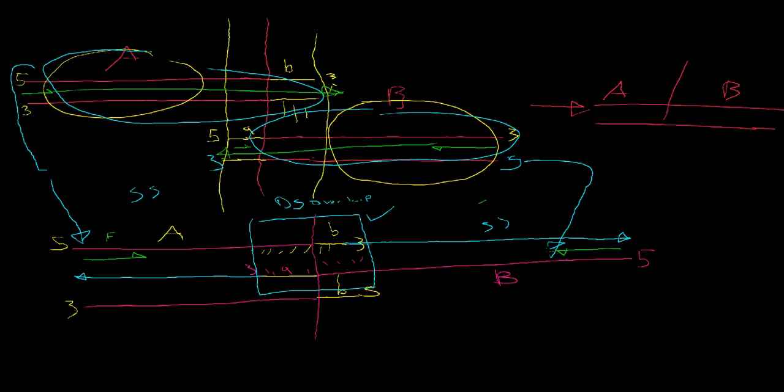So this guy is going to extend that way. Oops, that should have gone over. And this oligo is going to extend this way. So we've just doubled our product in our second step. And then from here, as you know, this is just a chain reaction that explodes.